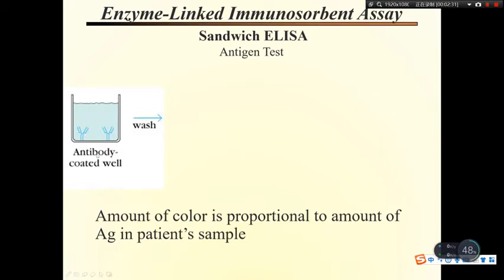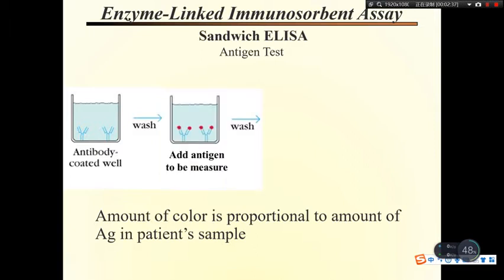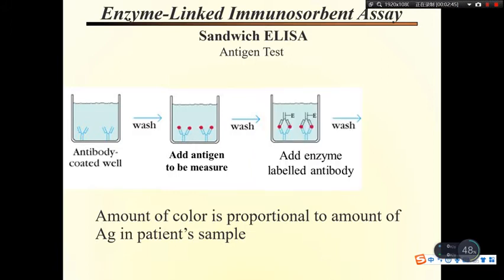First, the walls of the microplate are coated with the antibodies, and then the antigen-containing sample is applied to the walls and bound to the antibody. Unbound products are then removed by washing, and the labeled secondary antibody is added. Hence, the sandwich is completed.